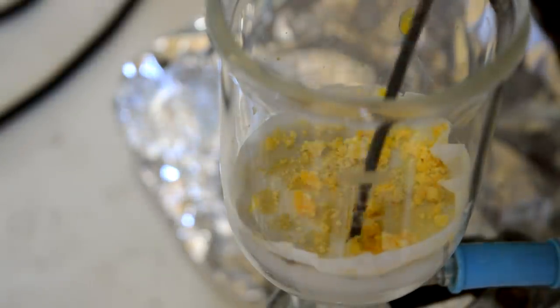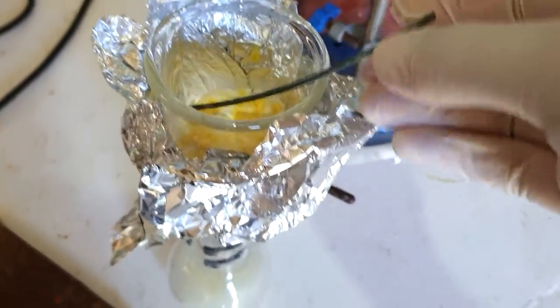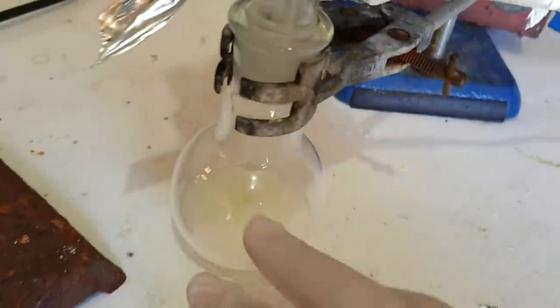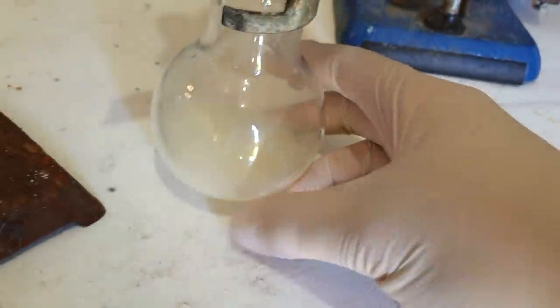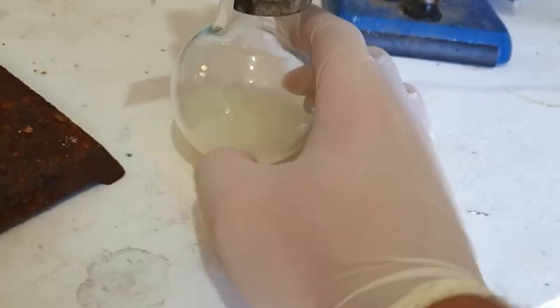All right, look at that. We have solid. It has crystallized out. Obviously, it's really yellow. It always is. The methanol was washing some of that color out, but it's also washing a lot of the product out. You can see it sort of crashing out down here, but not crashing out well, not really forming a solid here. So getting this solid back out of here might be a big issue.